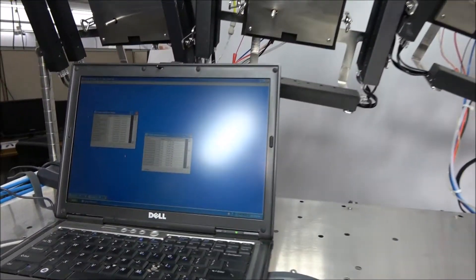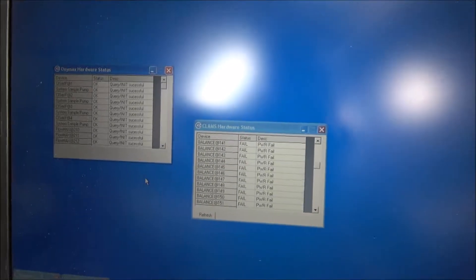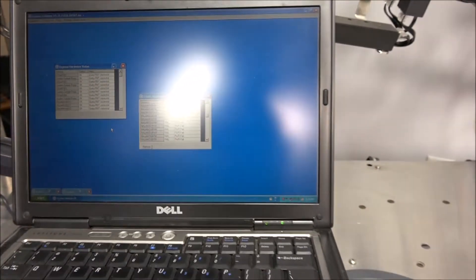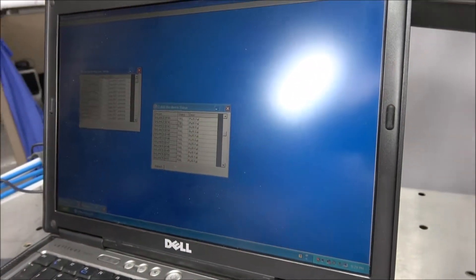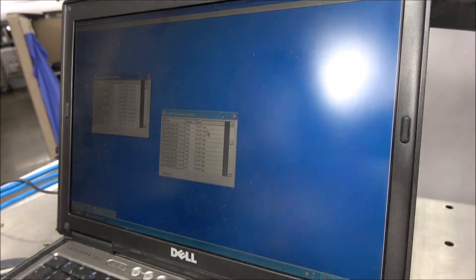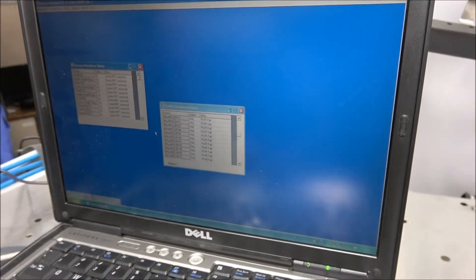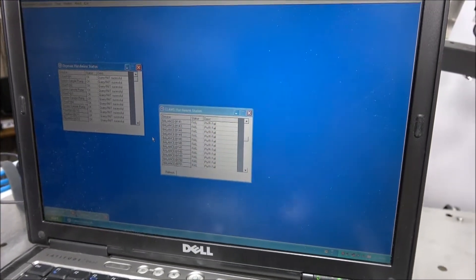The instruments communicate with the computer and may appear complex, but seek to reconnect to the computer if you've undone cables because you've moved them. This here is also a troubleshooting menu, and if you notice our balances say 'power fail,' that's simply because they're shut off. Oftentimes if you do have an error in the system, it will identify specifically where that error is.